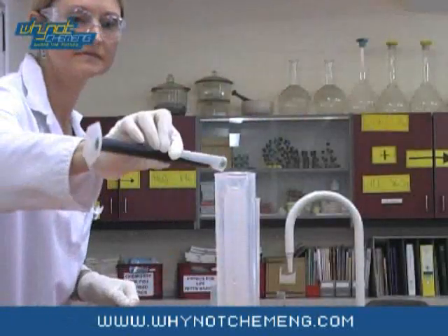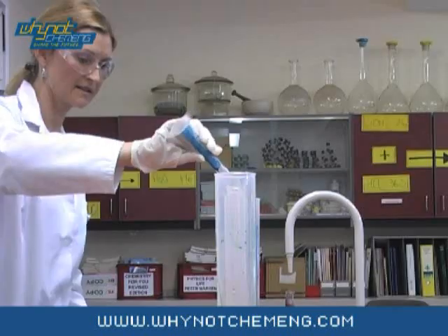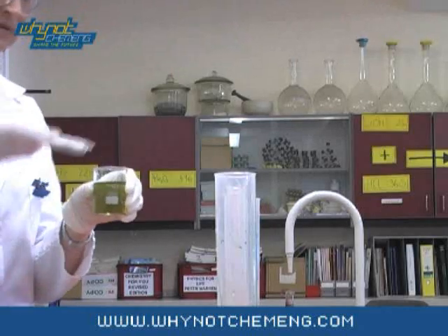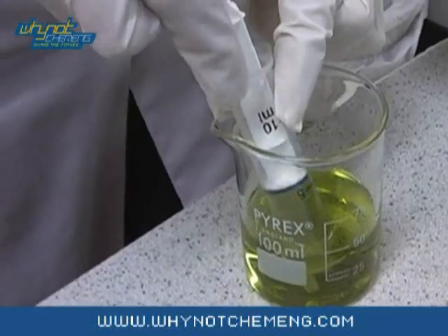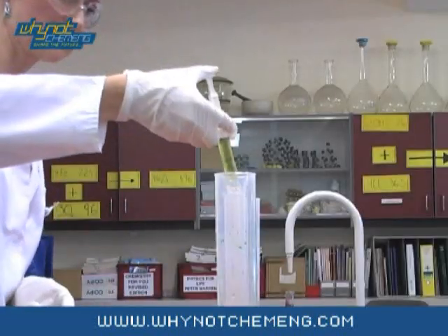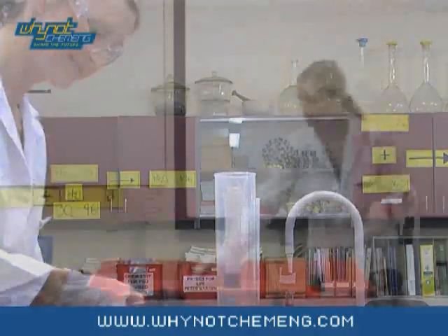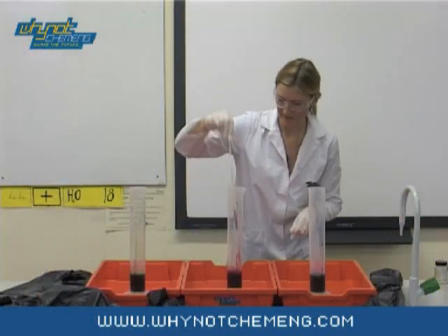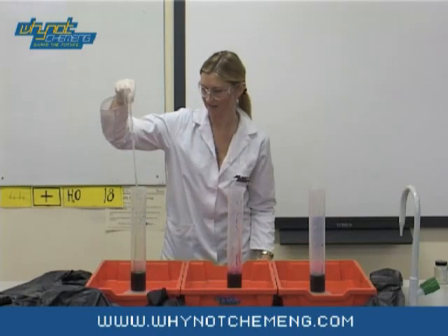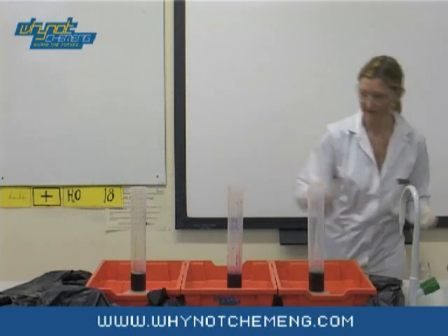Then, add 20ml of food colouring to each cylinder. Add 10ml of washing up liquid to each cylinder — I find using a syringe to measure the washing up liquid works well. Finally, give everything a stir. Add 10ml of potassium iodide to each cylinder and stand well back.